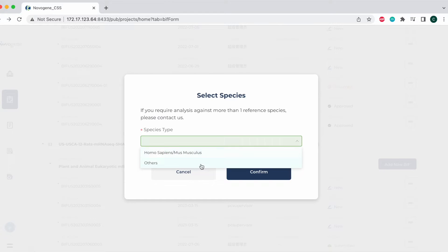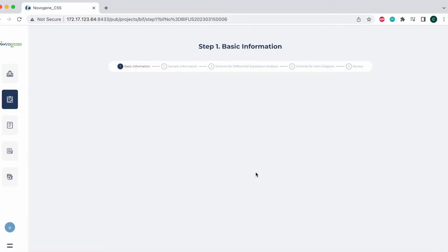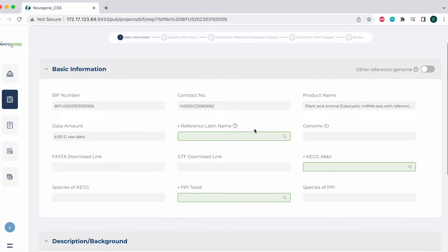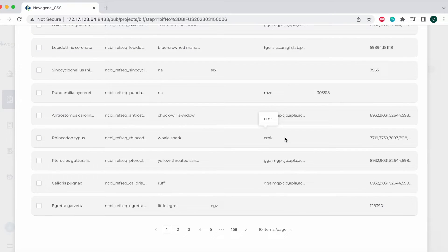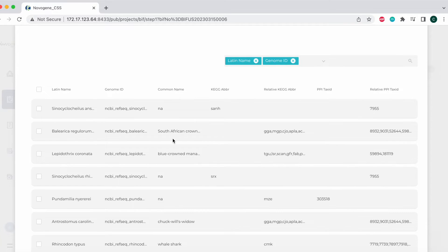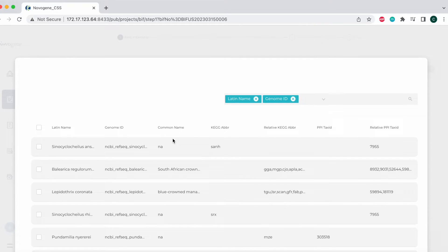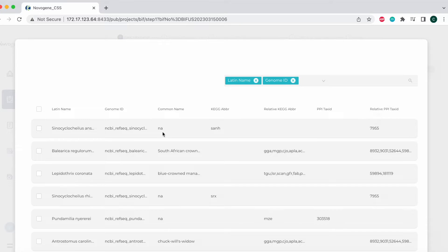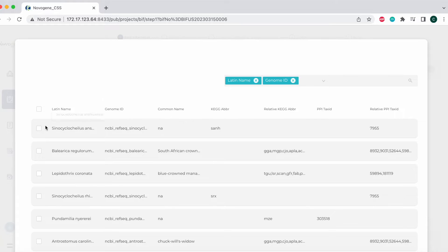If you select other as the selected species type, you will need to fill in the reference Latin name, CAG abbreviation, and PPI tax ID by clicking on the magnifying glass. When you do so, it'll bring up a different section that you need to fill out, and depending on whatever Latin name you select, it will give you the relative and associated CAG abbreviation and the PPI tax ID. You cannot mix and match CAG abbreviations and PPI tax IDs. Whatever is listed for that Latin name is what you will use.